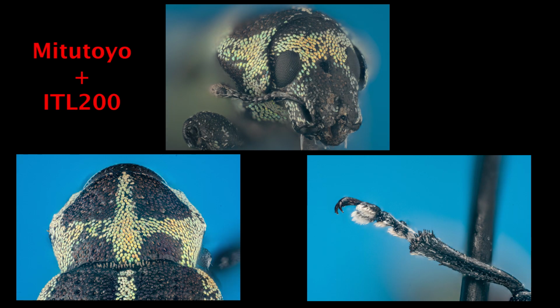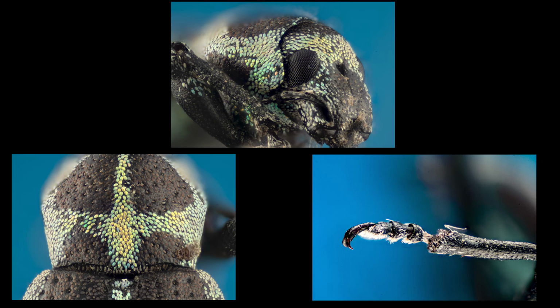And that's the point. I asked a couple of friends to take a look at a representative selection of these pictures. Just 6 of them, 3 sets of 2 of the same subject, same lighting, same everything. In all cases, 2 out of the 3 were picked correctly. These 3 here are the Mitutoyo ones. These 3 are the Nikons.